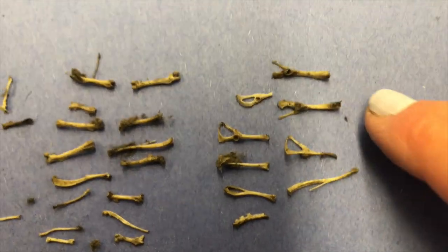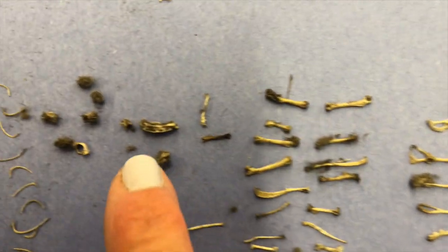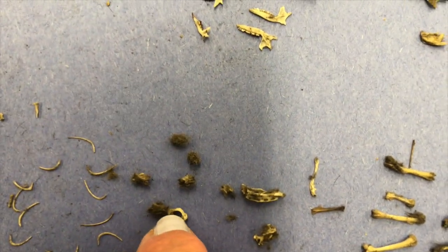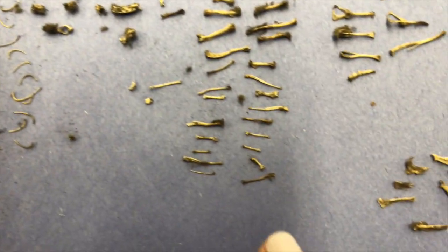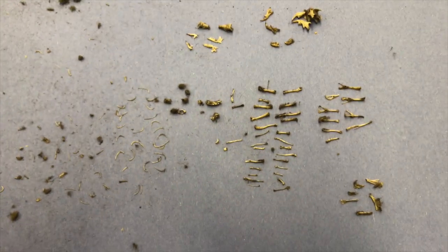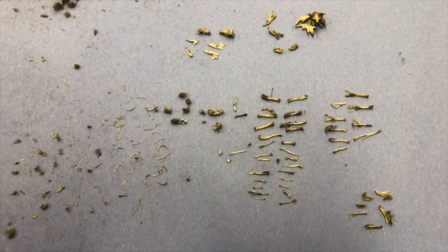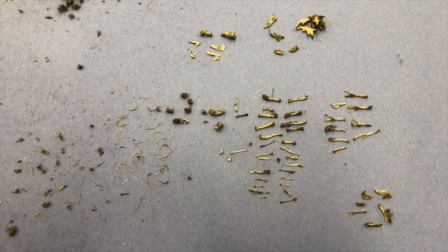These bones right here are like the hip bones, and these are leg bones. This bone is part of the backbone. You can see these little discs. That's like the shoulder collar. All of these are ribs. More leg bones. These are the shoulder blades of the little mice. So based on this, I can now make a prediction about what this owl ate in one day. Owls usually regurgitate 1 to 2 pellets every single day.